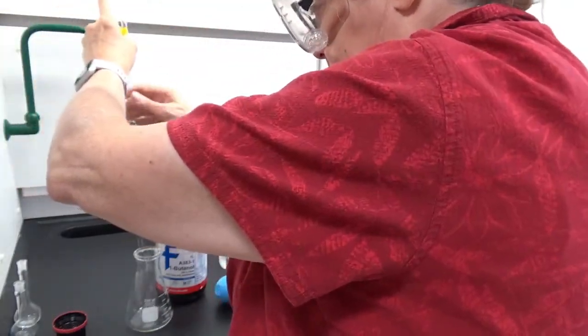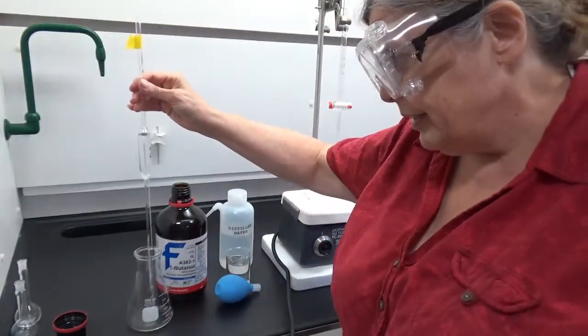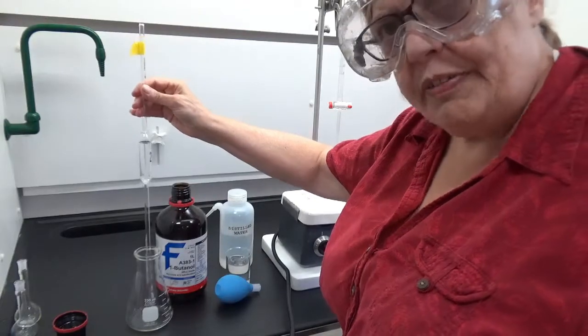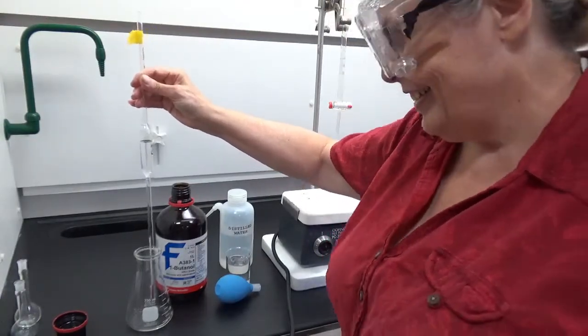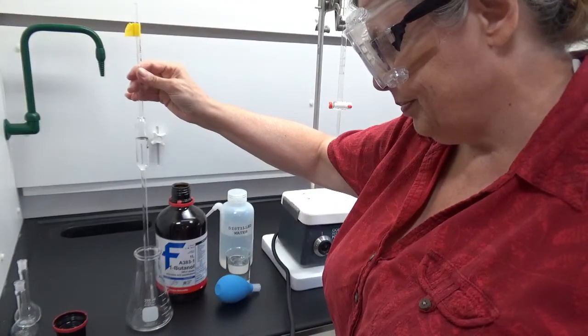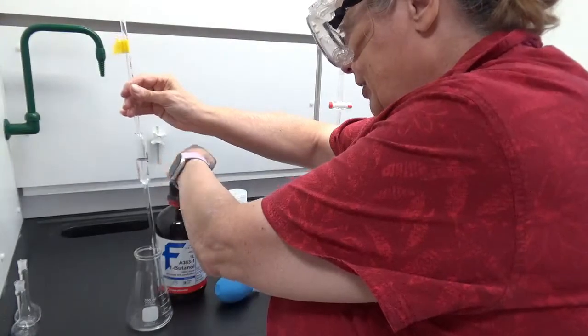Milliliters. Butanol doesn't smell very pretty, I'll tell you. Smells pretty foul. So I'm glad I'm doing this in the nice hood. That's all the butanol I'm going to need for a while.